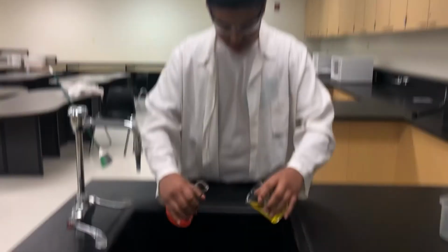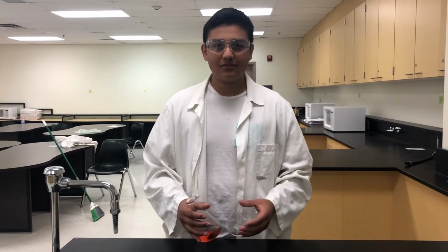These chemicals. No, you can't pour those down the drain. Why not? It's damaging to the pipes.